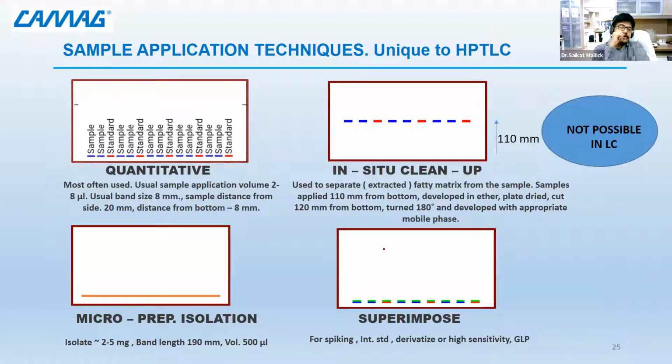Next, we move to different aspects in which you can do bioautography studies. The first one is a simple approach where standard and sample are applied onto the same plate and seen for the development part.